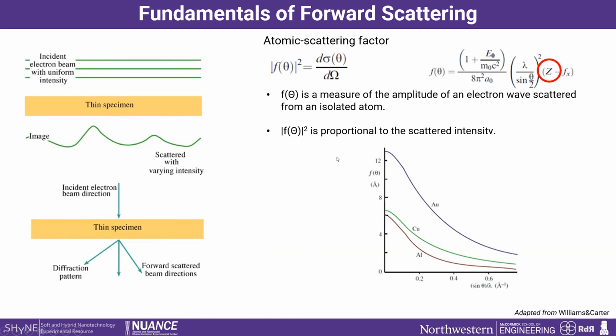The amplitude, the modulus of the scattering factor, is proportional to the intensity that you're going to see on your screen, right? And this is a nice summary for different Z values here, from aluminum to gold. And this plots basically the equation. This is something good to keep in mind, that dependency on Z. It's going to show up later in this talk, and also in your experiment, right? I have had many questions about that: how can you distinguish different atomic species in your sample using diffraction, using the amplitude of your diffraction pattern?